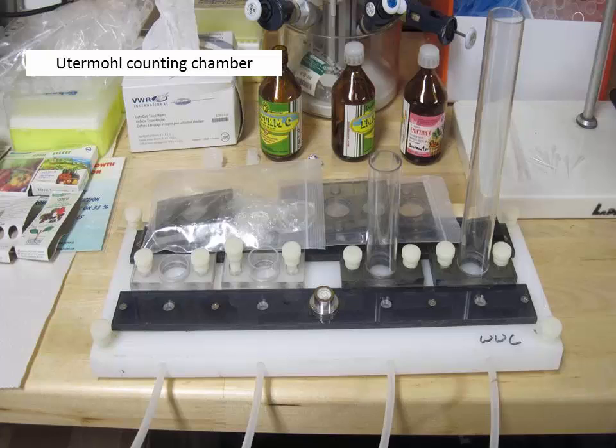And these screws come off. You put the chamber in there, and then you could have a filter disc, and then you attach the vacuum, and then here each one of them is vacuumed. So you can do it two ways. You could settle, typically standard is settle overnight or 24 hours.